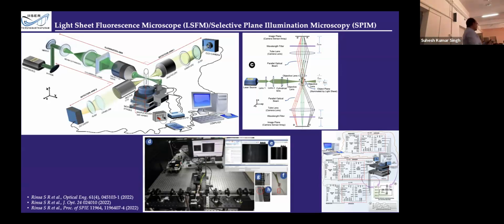Conventionally, what we do is adapt one by one, but it loses the time resolution. We cannot get it. With this one, we are able to see simultaneously. Okay, so this is the whole structure, the architecture, the controlling system and all these things.